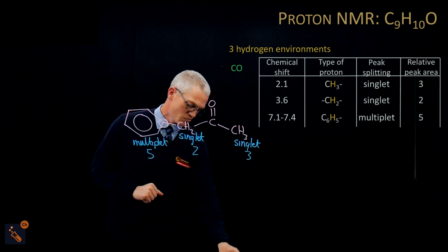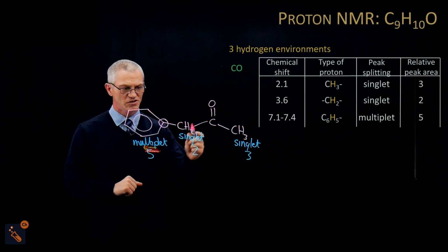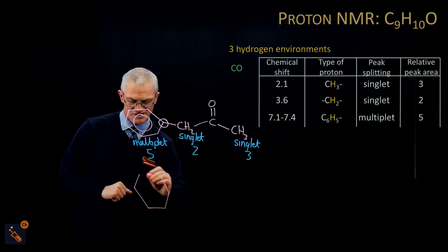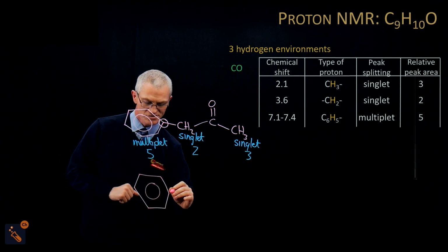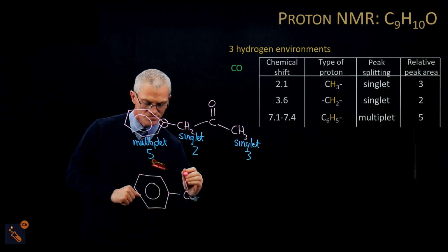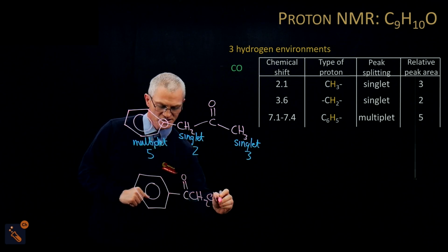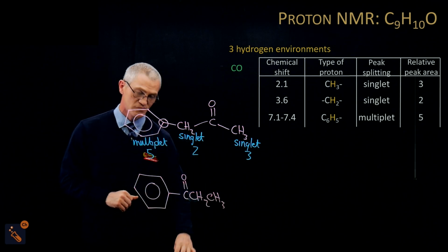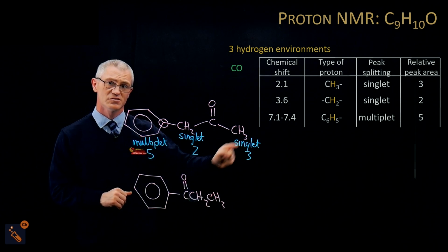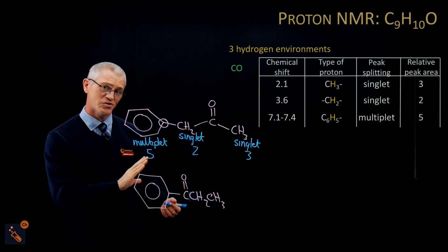Now I want to show you what mistake you could have made. So you could, for example, start fiddling around and start doing this. Because it's all about how this jigsaw puzzle fits together. So you could put CO, and then CH2, and then CH3. So that's the other way. So let's think about why that would be wrong. Sometimes your initial guess might be wrong.